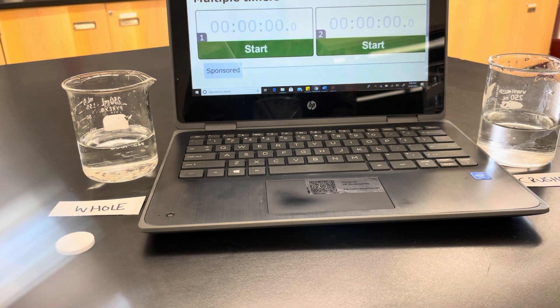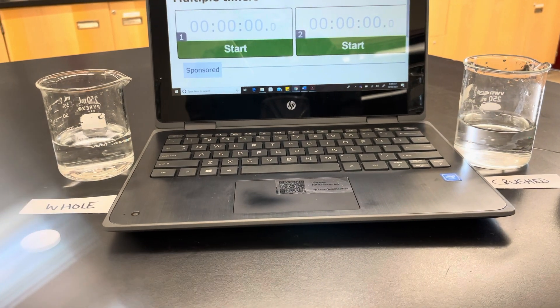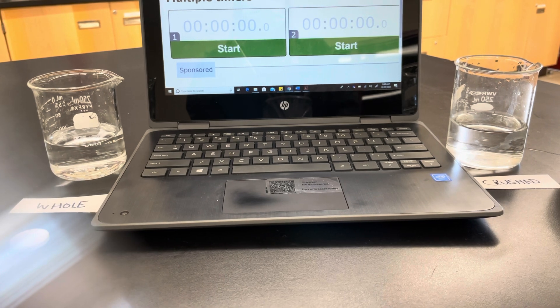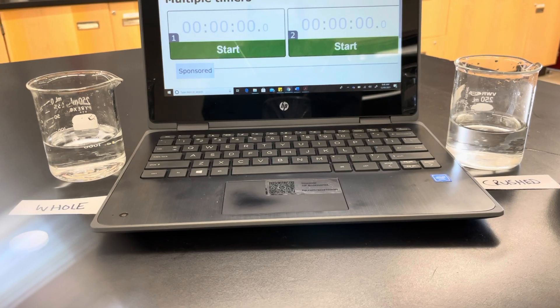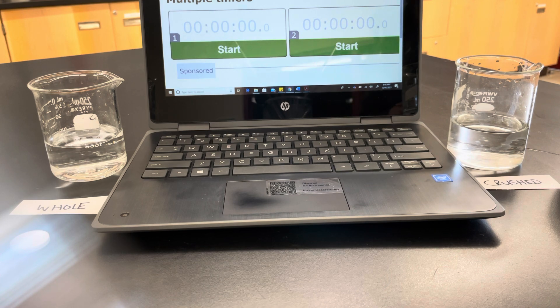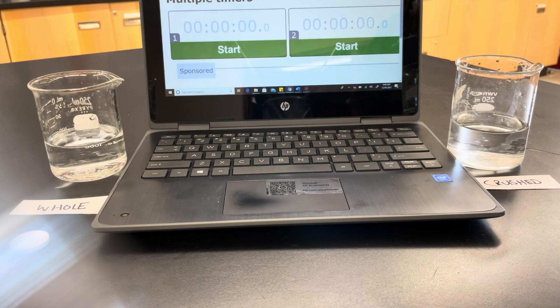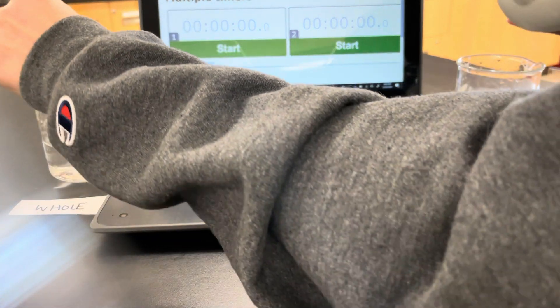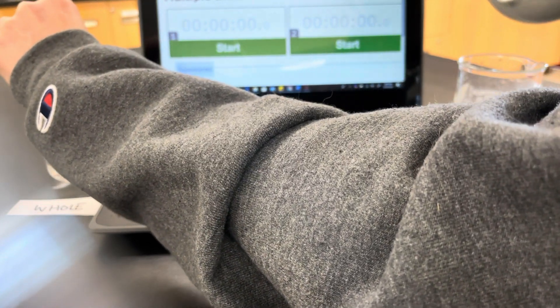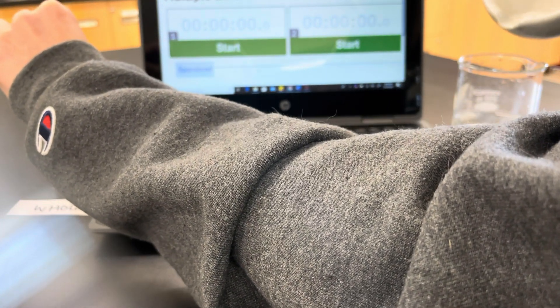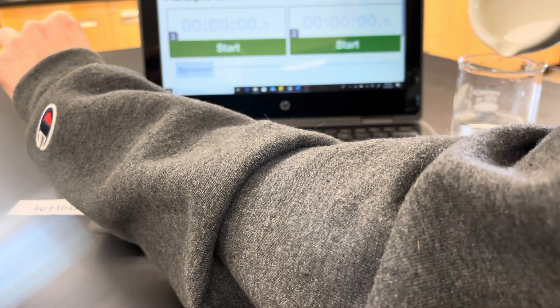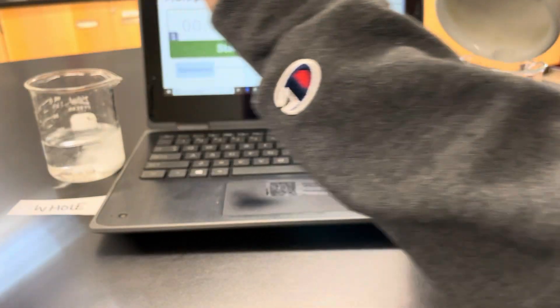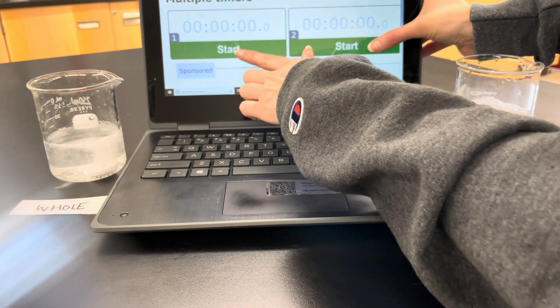We're going to put these in at the same time and try to hit the timer around the same, so we will see which one reacts faster — or if there's going to be a difference at all. Here we go. Make sure all the crushed is ready to pour in so I don't miss any. Start the timers.